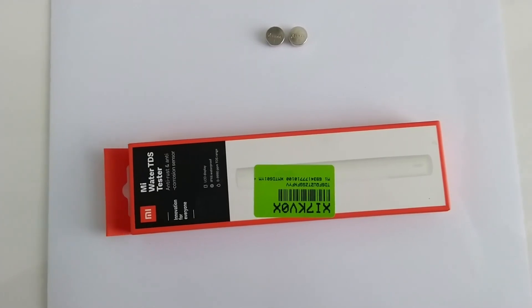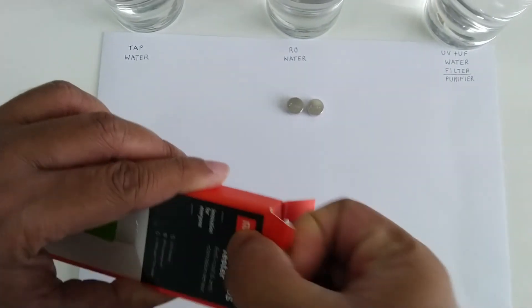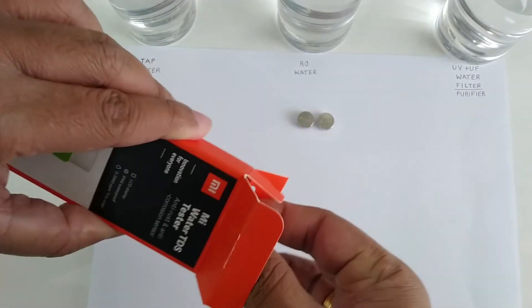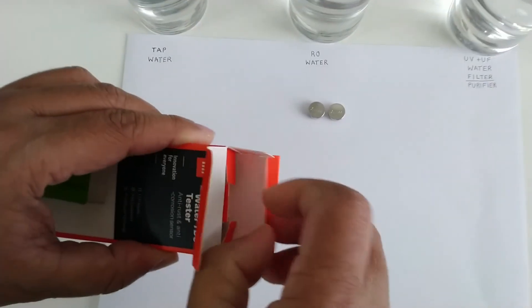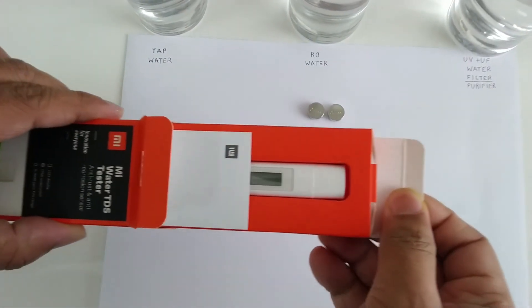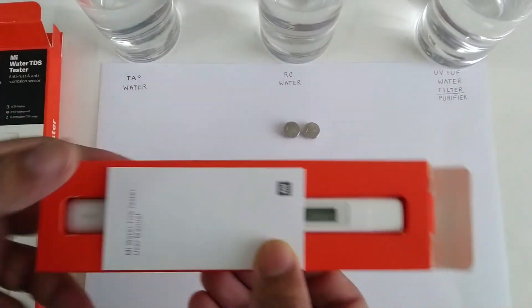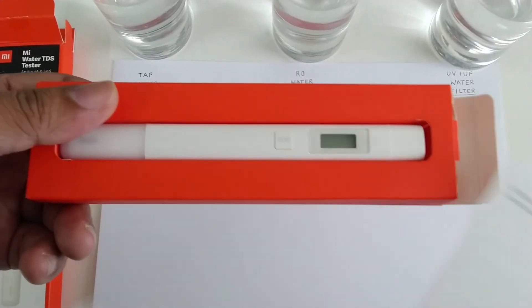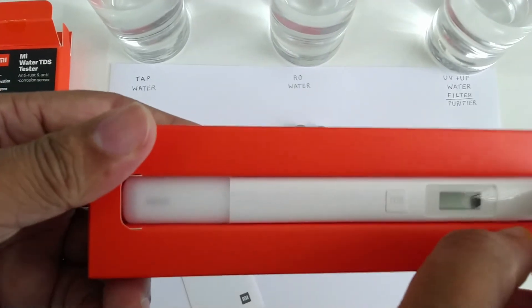Now let's see what's inside the box. We have the user manual and the Mi TDS Water Tester.